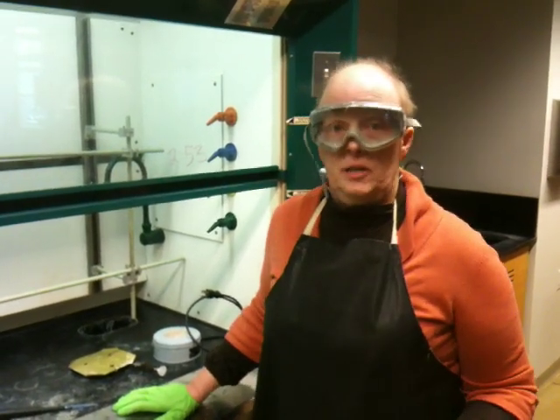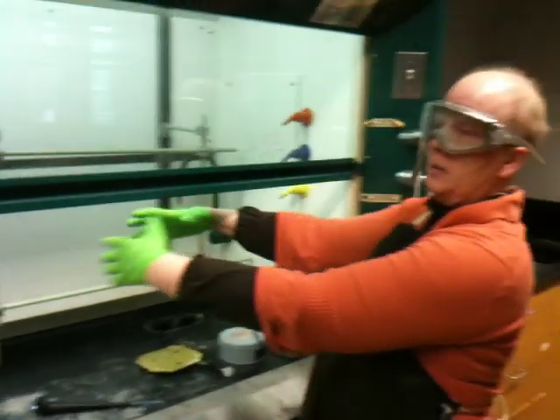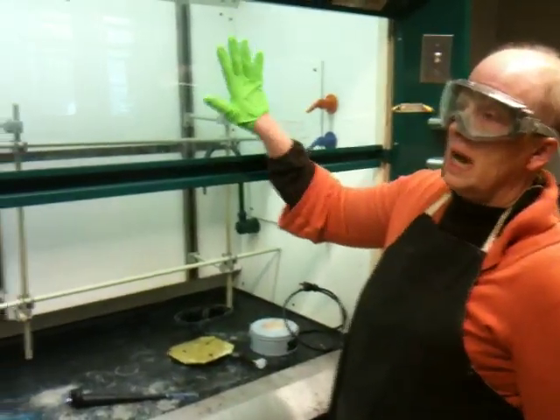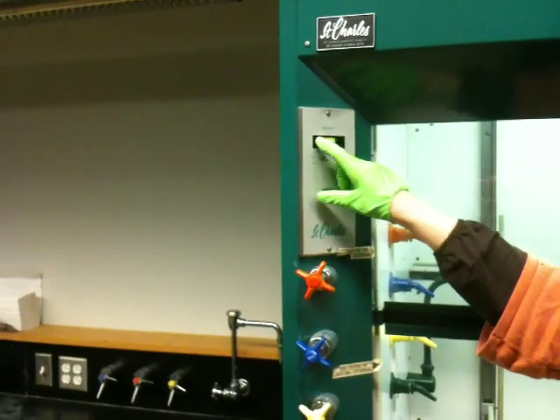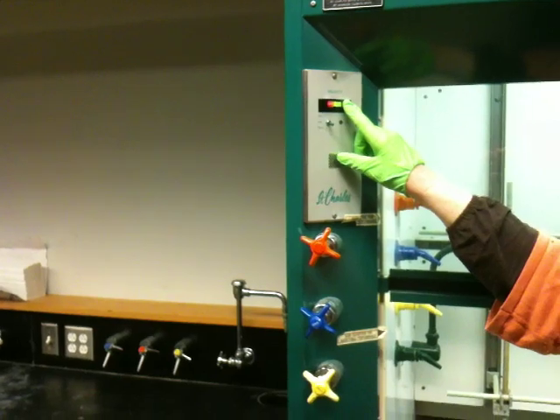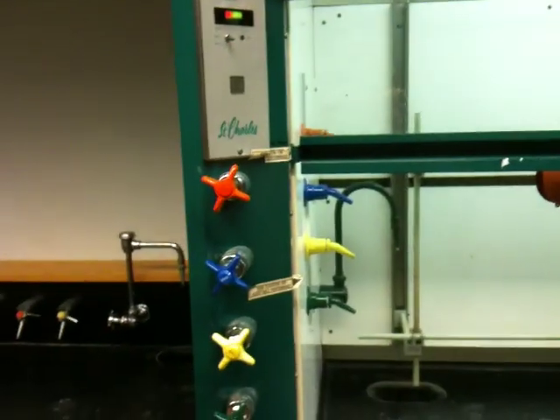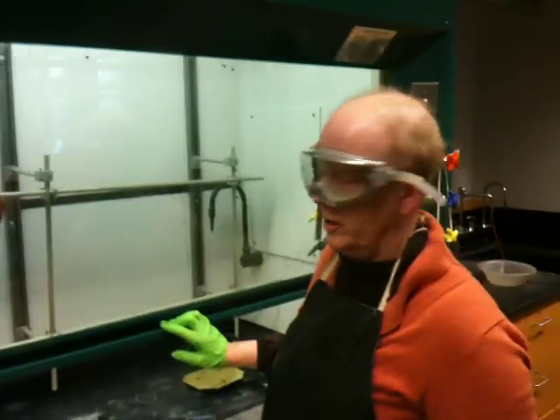I have all the pieces for a still. The first component — well, first of all, a still has to be built in the hood. This is an operating hood. This hood is on because the velocity is high, and that's indicated by a green light. The best position for the hood when you're setting up is this position. You can bring the hood door down lower when you're actually doing chemistry.